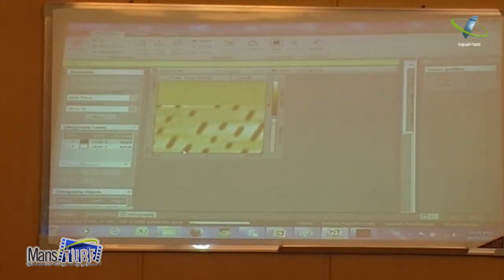And I'm not sure what we will get because the other one was really scratching, and now we are just pushing. Maybe, because scratching we have more force. At this point, maybe we'll not see anything. I'm not sure. Maybe we need to apply higher force.